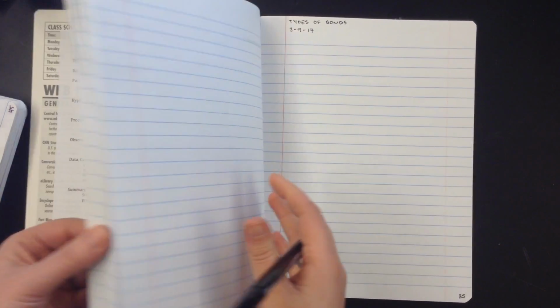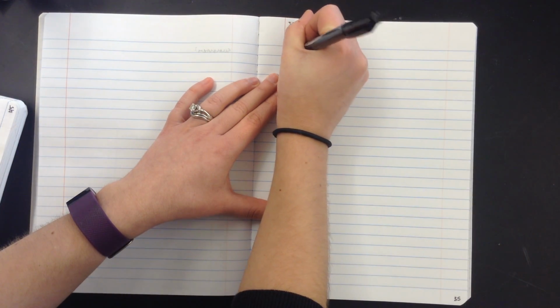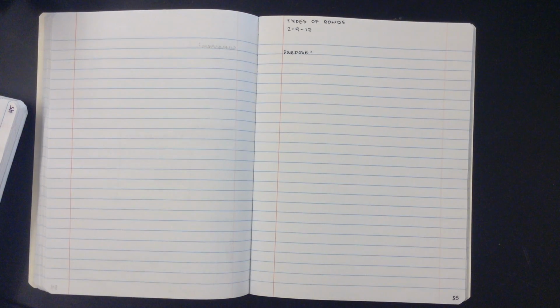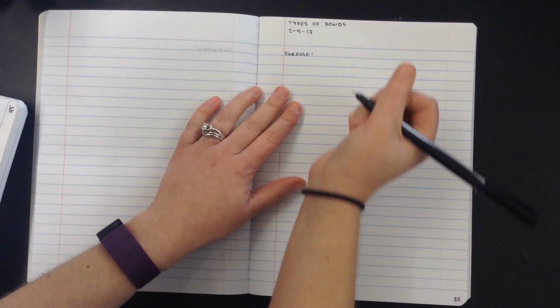Okay. First up, I'm going to put in my purpose. And the purpose of this lab is to categorize compounds based on their physical properties.